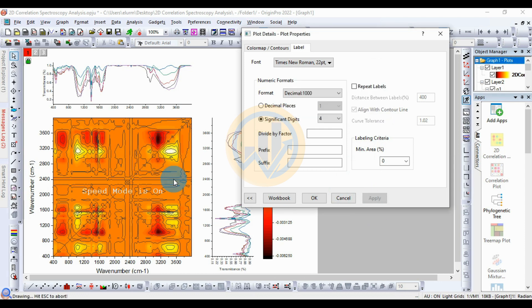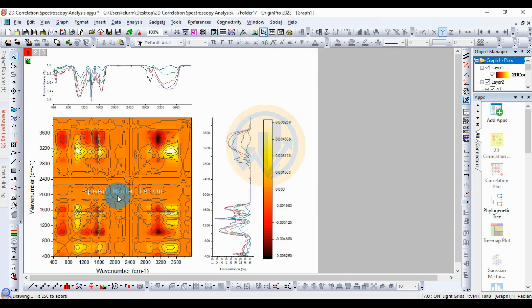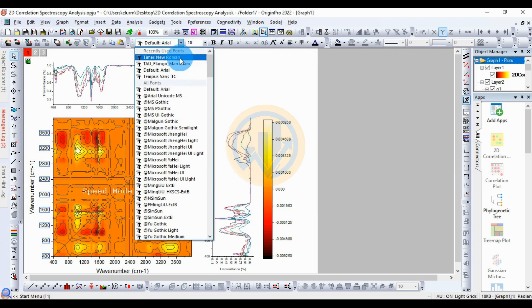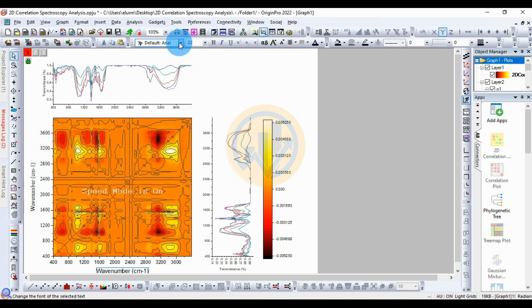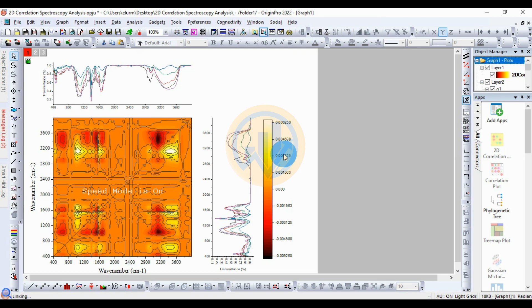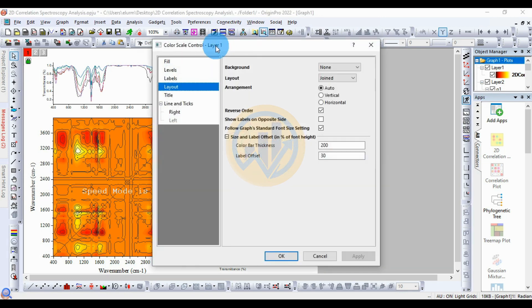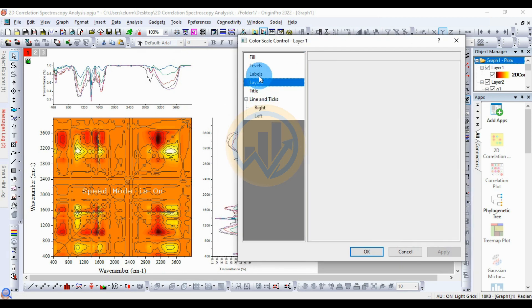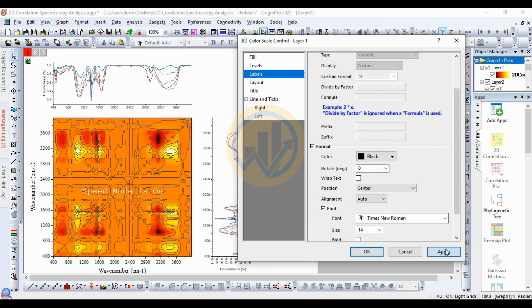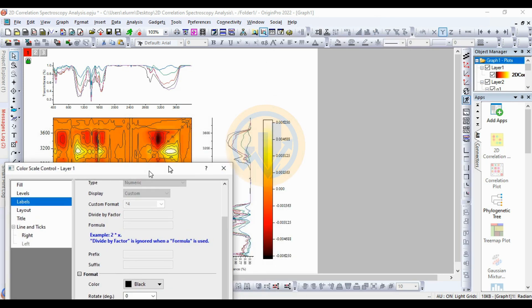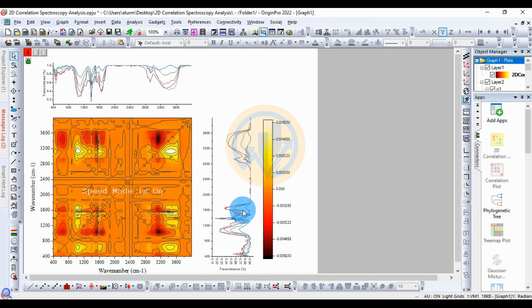Click OK — the label is now changed. This also changes the font for the wave numbers. All text is changed to the new font. Next, change the scaling font as well. Double-click to open the color scale control. For the label, select the font and change it to Times New Roman, then click apply. The font size is also changed. This is the FTR graph for our five sample set.